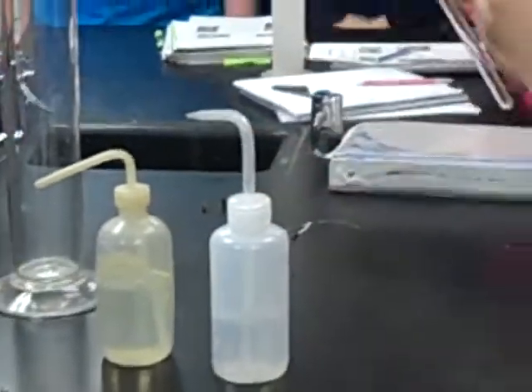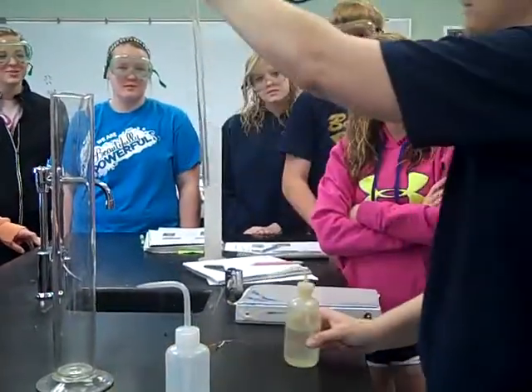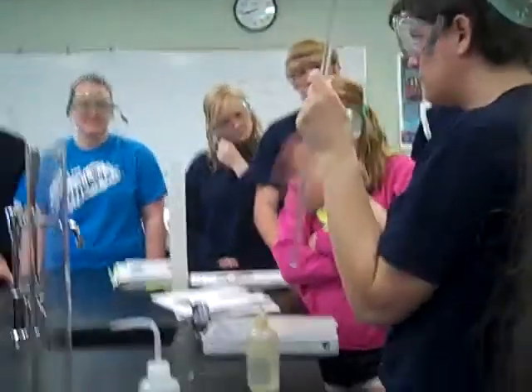In this graduated test tube, you're going to add about 10 milliliters of hydrochloric acid. It doesn't have to be exact.